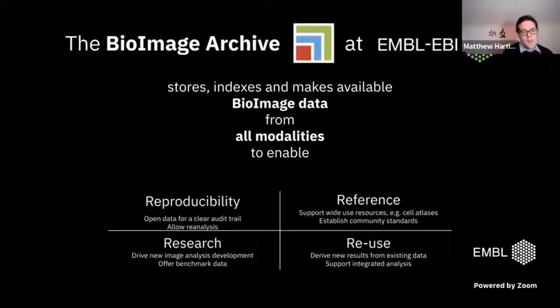And then two closely related reasons to have an image archive, both related to reuse of data. One way to reuse data is to be able to get new scientific results out of existing data sets. And that is important. Sometimes this will be being able to do perhaps some preliminary research by looking at images and thinking if there's ways in which they could be used differently from the purpose for which they were originally intended. But another reuse direction is that modern biological image analysis is very dependent on having reference data.